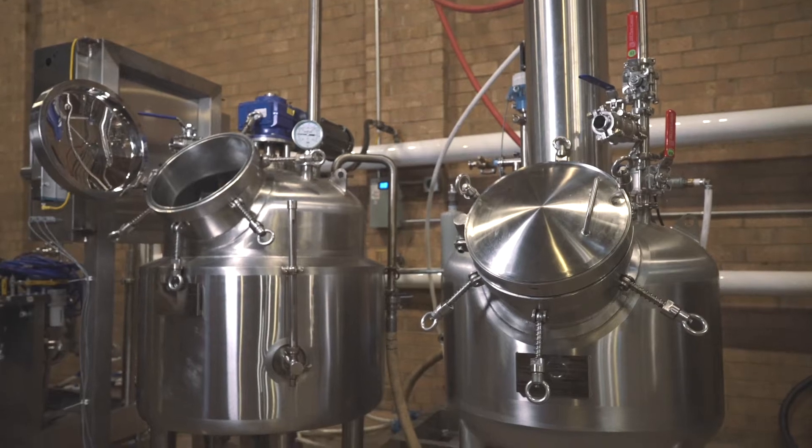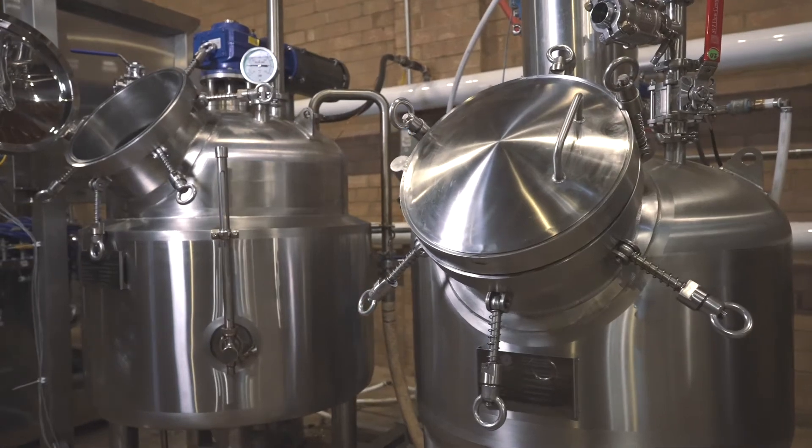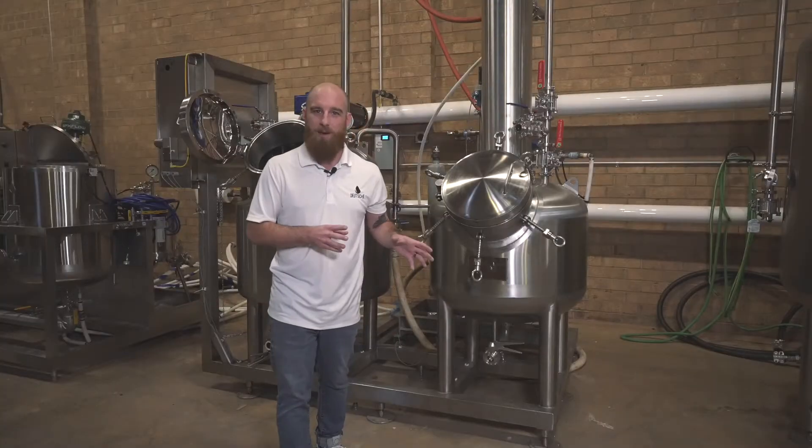Behind me is our 200-liter model, which has a recovery rate of around 50% of the volume inside the tank in about an hour. And it's designed to take solvent concentration levels as low as 10% by weight when it's done.